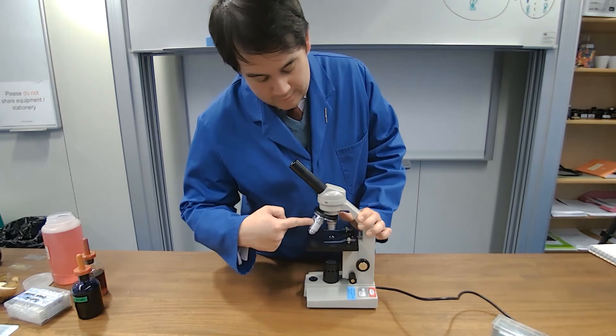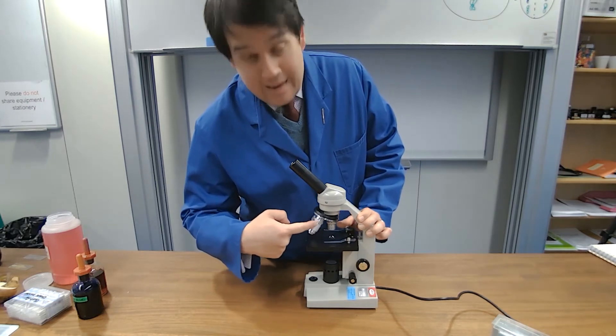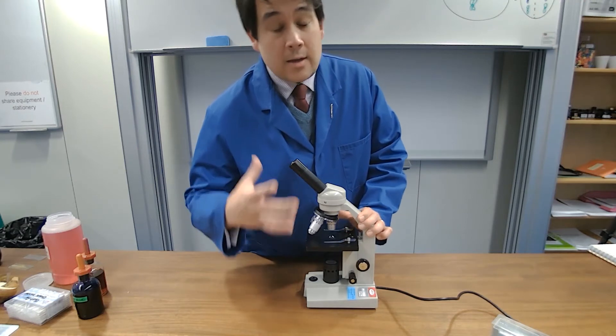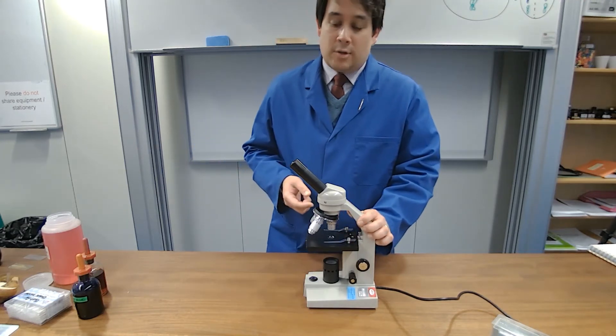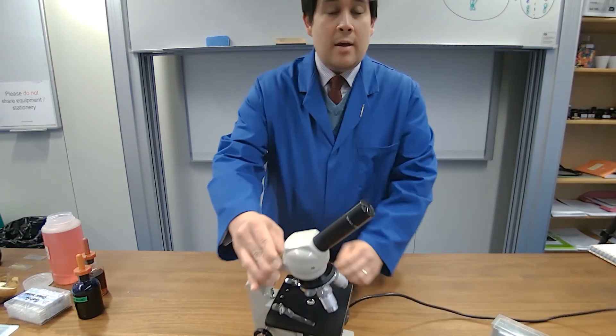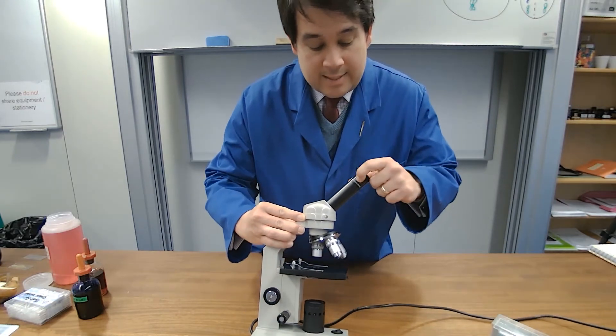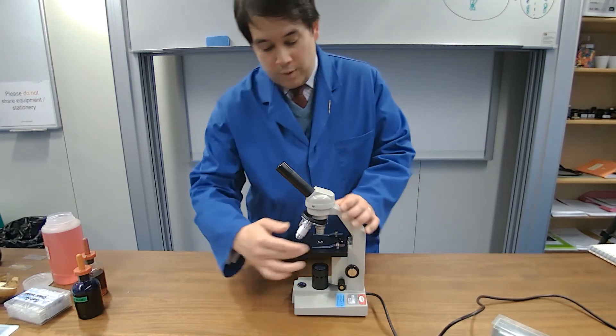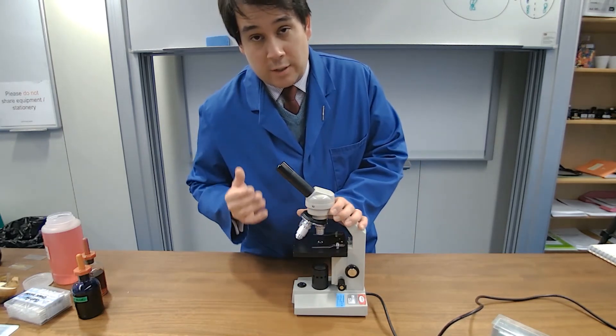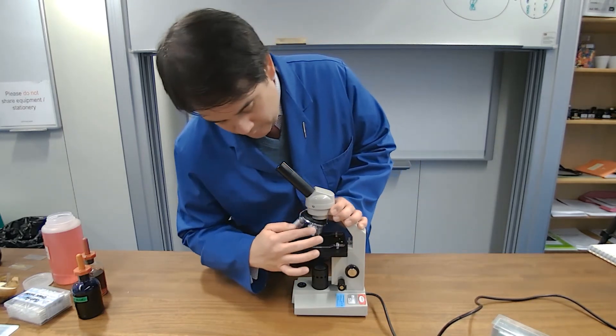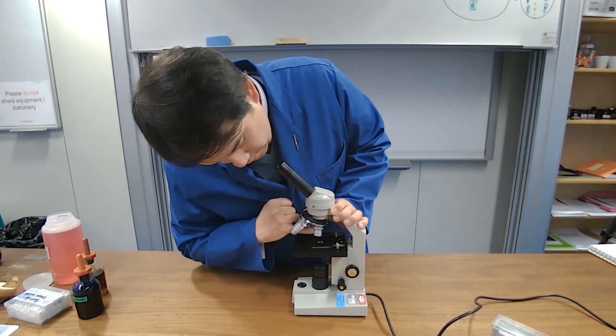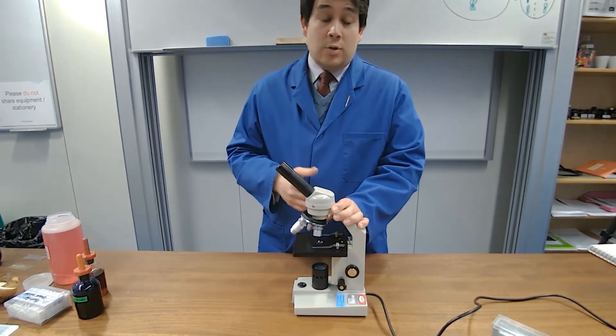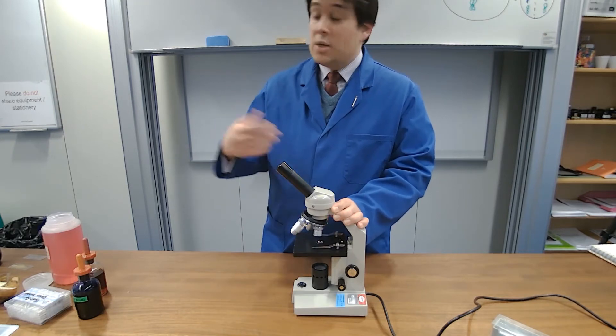We then have the objective lenses and using the magnification written on there and there together we can calculate certain magnifications that we might be using. So if you look closely there you will see that it says that it has 10x magnification. We then multiply that with whatever the objective lens is we're using to look at the specimen. So for example this has the number 4 written there so 4 times 10, 40 which means that you're using a 40 times magnification to look at the specimen.